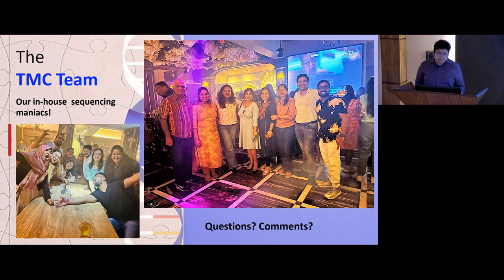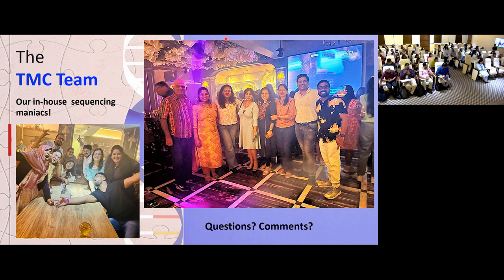I think the recent R10.4.1 chemistry specifically looks at this as well. But I agree with you, it remains to be seen. The error rate is higher in tissue, and we require better chemistry to improve upon that. It's very sensitive to degraded DNA. I think the quality of input DNA is most critical for these long read sequencing processes. As Gaurav said, the R10 is better simply because it enables duplex sequencing, and therefore the accuracy of sequencing is better. So it's not to do with wax, it's the fragmentation from formalin.